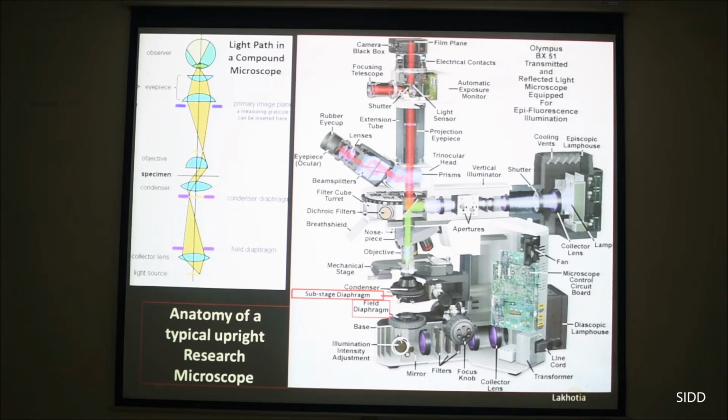So this microscope we call upright microscope, which is the more conventional one. There is a version of this, inverted microscope, where the objectives are on the bottom, light comes from the top, but you see it the same way. Maybe somewhere I will have a slide to show that. So this microscope has a typical visible light source here. Light comes from here through a series of lenses and filters so that you can change the wavelength of light as you want to enhance contrast.